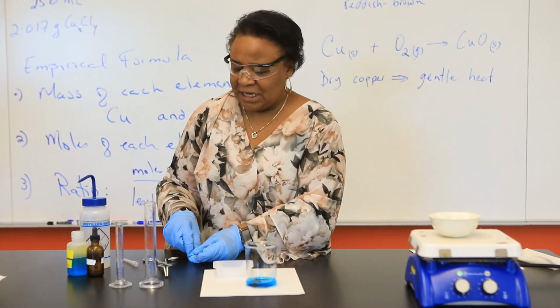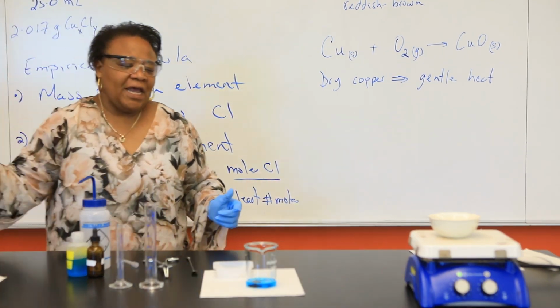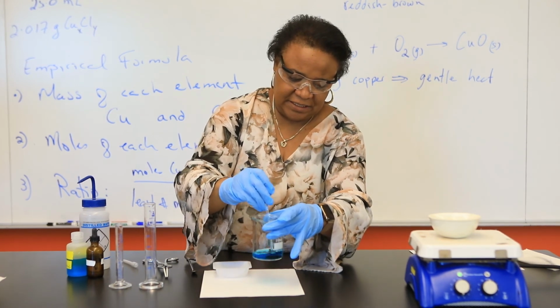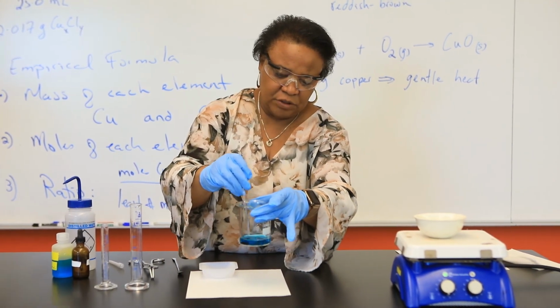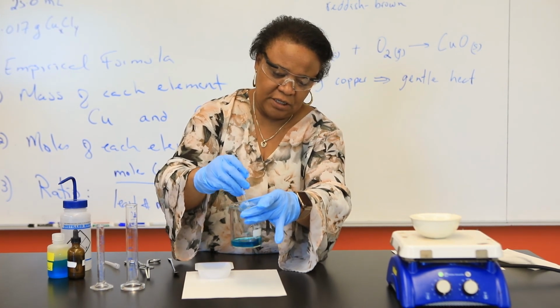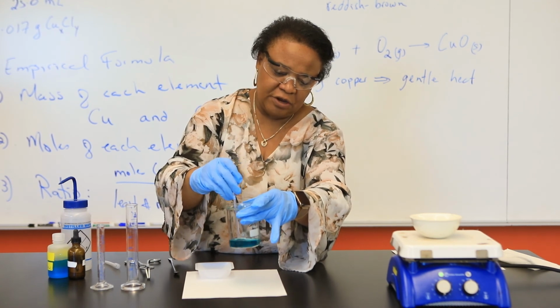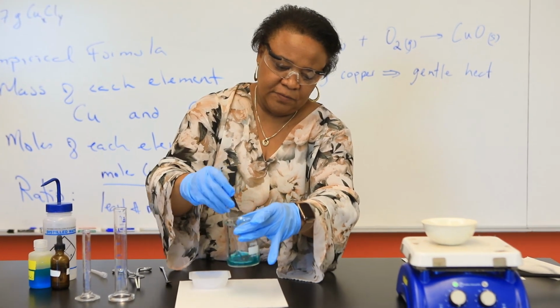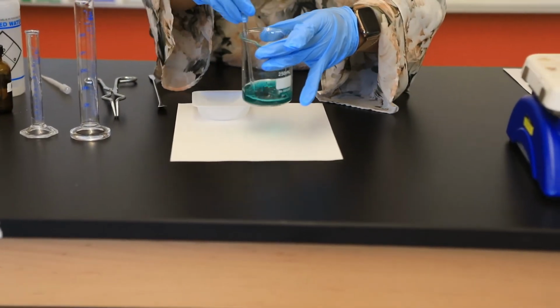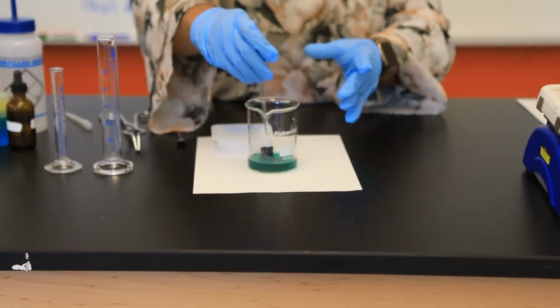But as soon as I add that zinc metal, you can see the deposit of copper, that reddish brown copper, on that shiny metal. So it's no longer shiny, but it looks now reddish brown in color. Notice, if you recall, I said what? Copper solutions are blue in color. I will know when this reaction is complete.